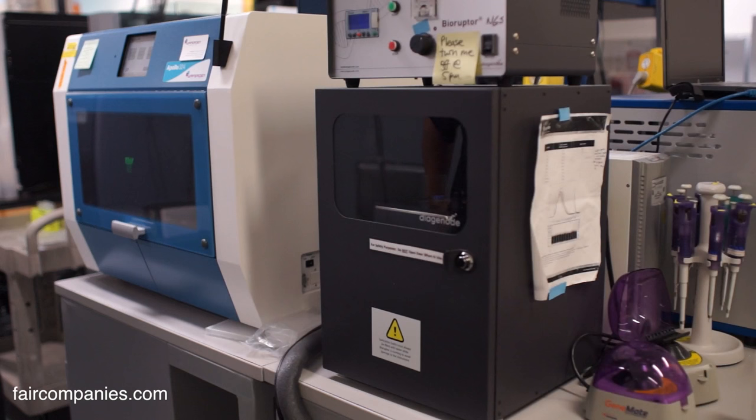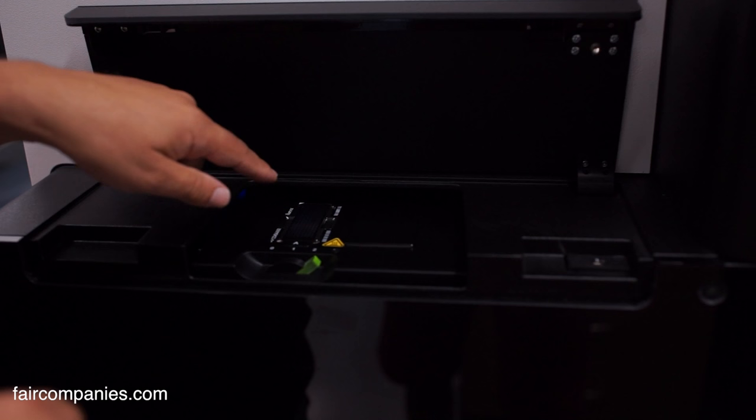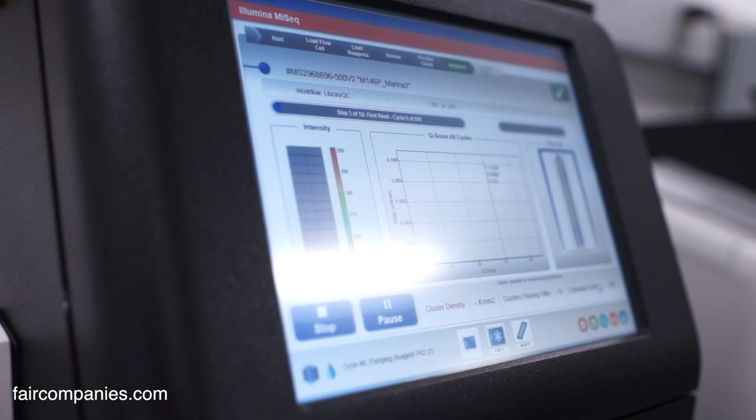So this is where the toys are. These are robots for processing samples, mostly. And then these are some of the DNA sequencing machines. This little chip can read the DNA sequence from like 40 million pieces of DNA in a few hours. The amount of data that comes off of this, and the cost, it's so cheap. Just completely amazing. I'm still flabbergasted by the whole thing.